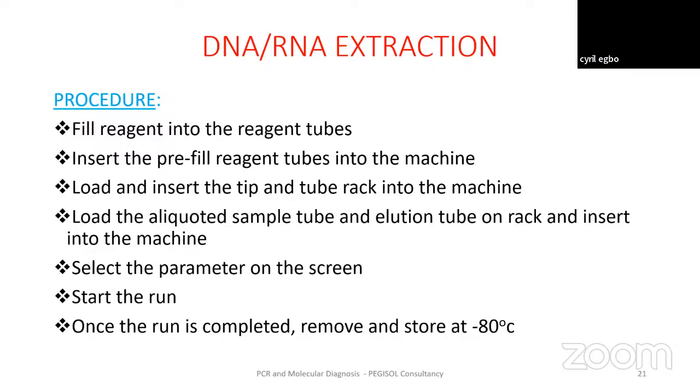So they will analyze it. It's not that the extraction is excluded. They are put together. They perform extraction, they perform the analysis. They extract, they amplify, and they analyze. So everything is inbuilt in those machines that I just made mention of.